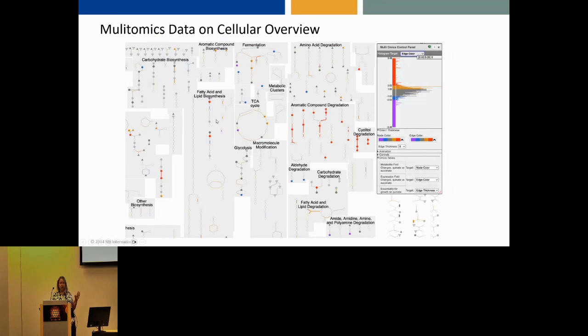We can also use node size or edge thickness as additional display dimensions. So if you have additional kinds of data, you can include them, or if you want to include significance scores for thickness or whatever, you can do that.